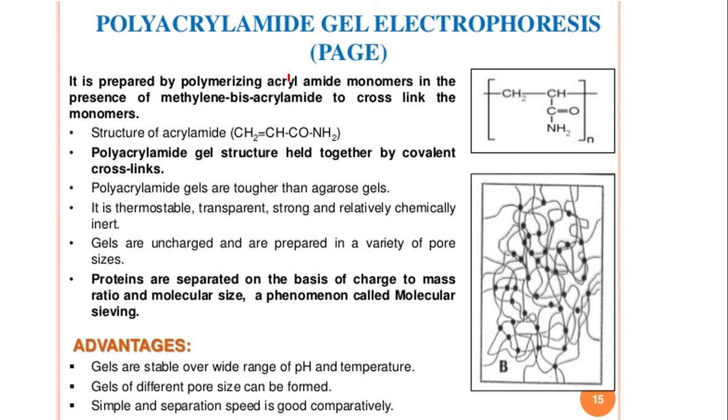You see, what is PAGE and how is it prepared, etc. PAGE is actually polyacrylamide gel electrophoresis. Here, the polyacrylamide gel structure is held together by covalent crosslinks. They are tougher than agarose gel. So there are many advantages for using polyacrylamide gel electrophoresis.